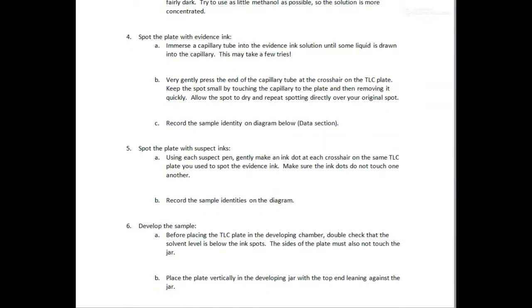What do you mean by developing the sample? Developing the sample means you take this TLC plate and place it in a developing chamber, the chamber which has already been pre-equilibrated with the mobile phase. And you allow the ink samples to move across the TLC plate until almost 3/4 of the plate is covered.